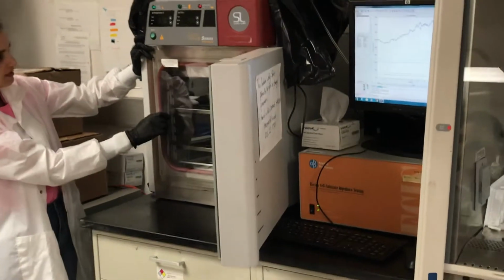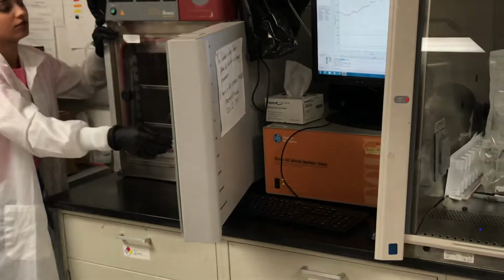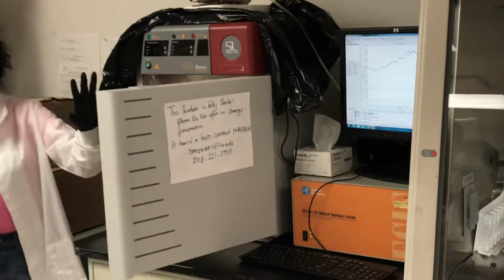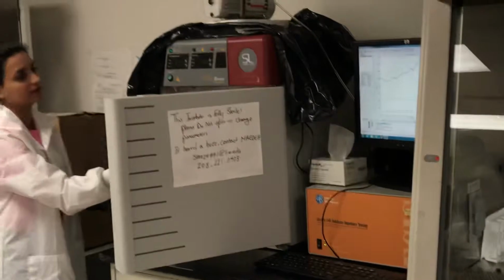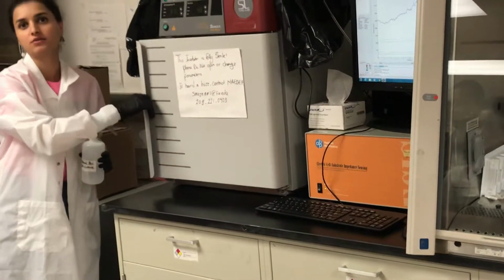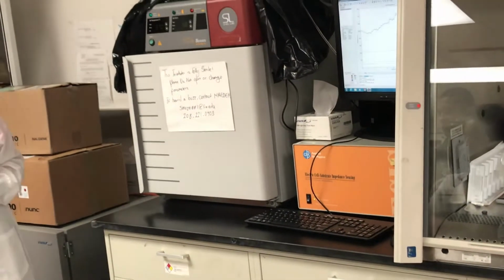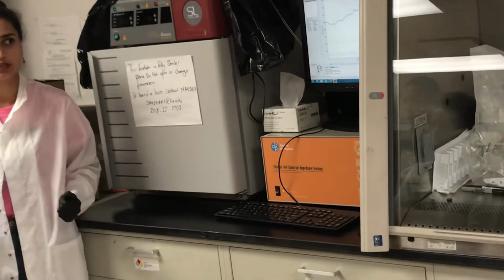If you can see the device, I really can't take that out. But do you see that thing in there? Technically, all the cells are attached on the bottom, and that's the food, technically. We call it media. It has glucose, glutamate, everything that they need to grow. All right. Any questions?